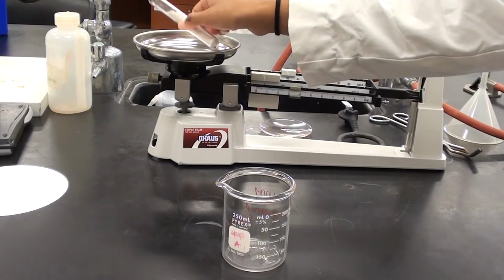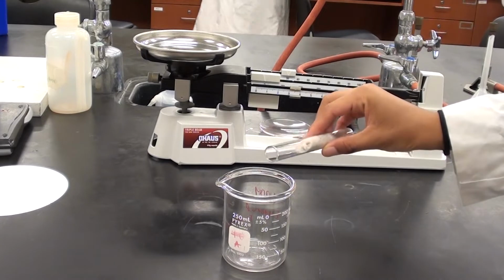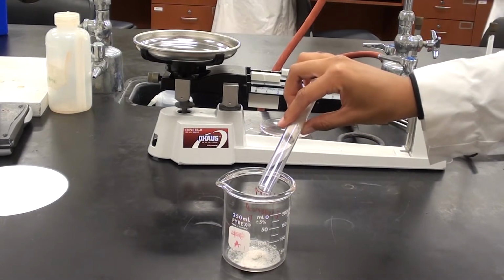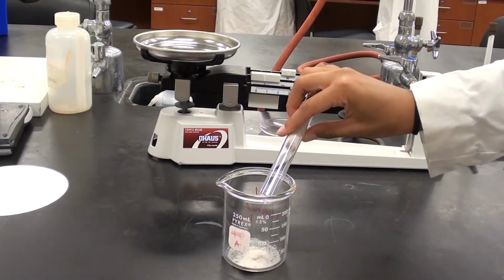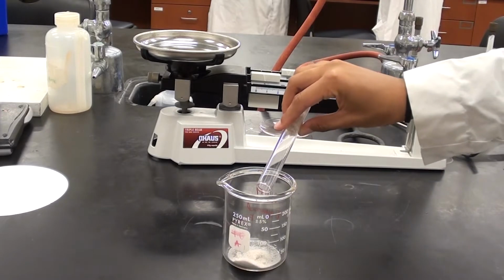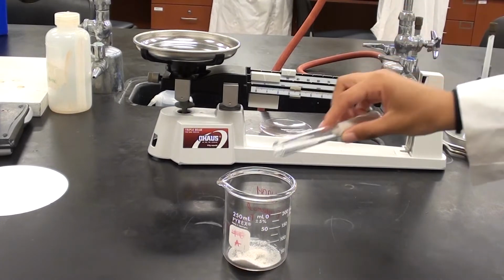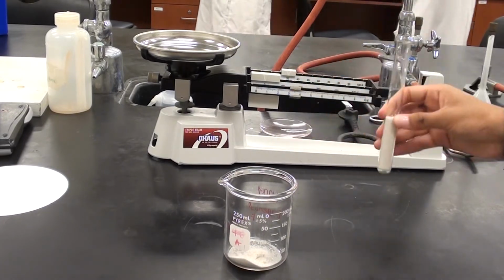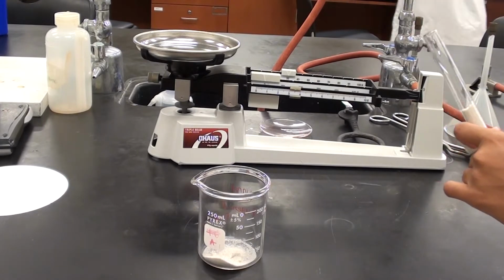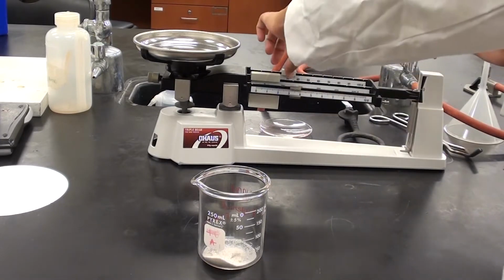Half empty. Now what Sabrine is going to do is pour half of that sample. Because we're going to use this for 2 trials, she's going to pour half of that. It doesn't have to be exactly half, but somewhere in the ballpark. Alright, she's doing a good job here. And a little bit more. A little bit more. That'll do. Alright. And now she's going to weigh this sample without the sand that she just took out. So go ahead.